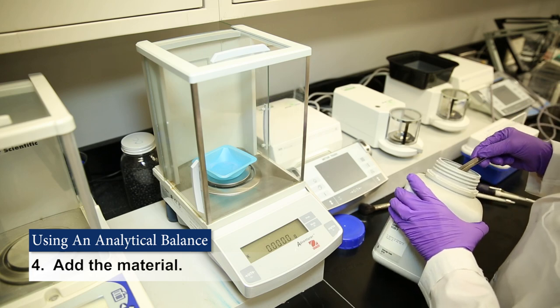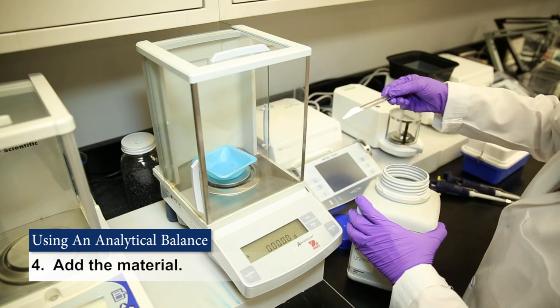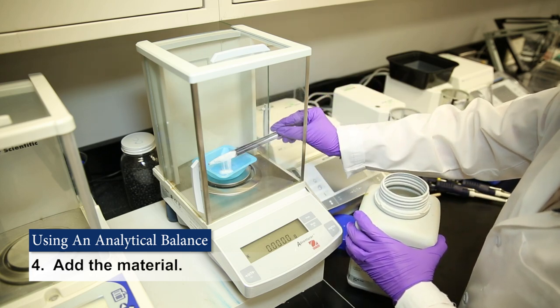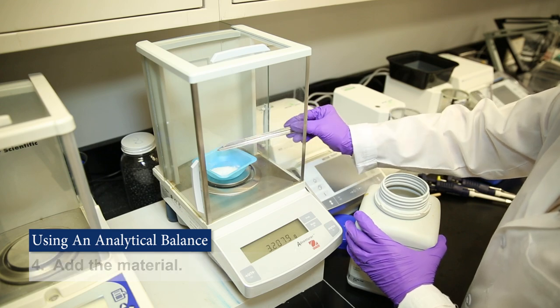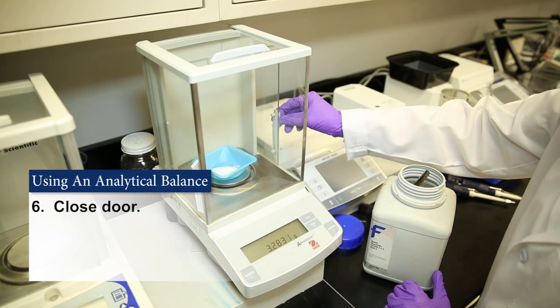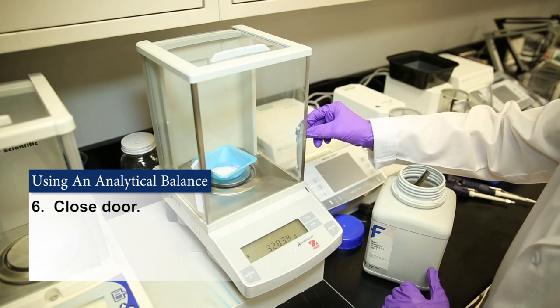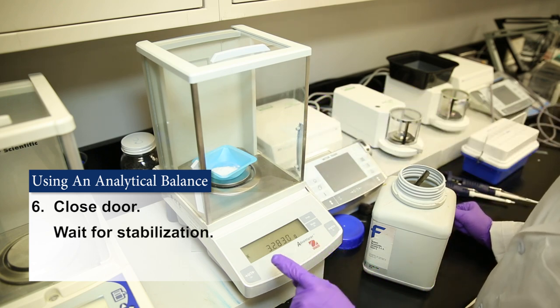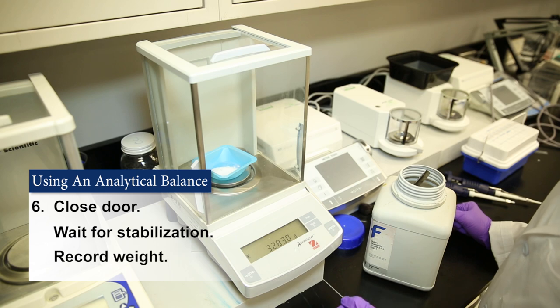You'll then add the material to be weighed. You'll want to close the glass doors again and wait for the reading to stabilize. That's indicated by an asterisk. And you can record that weight.